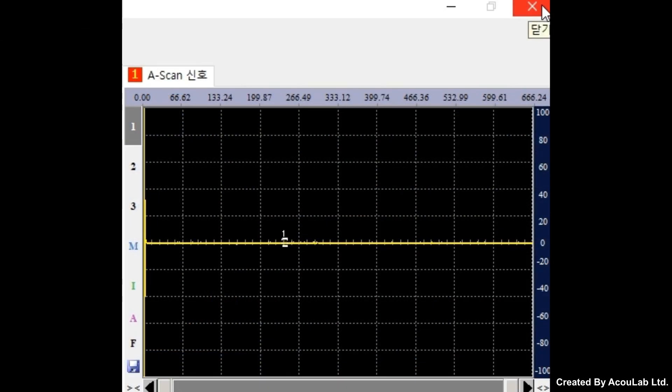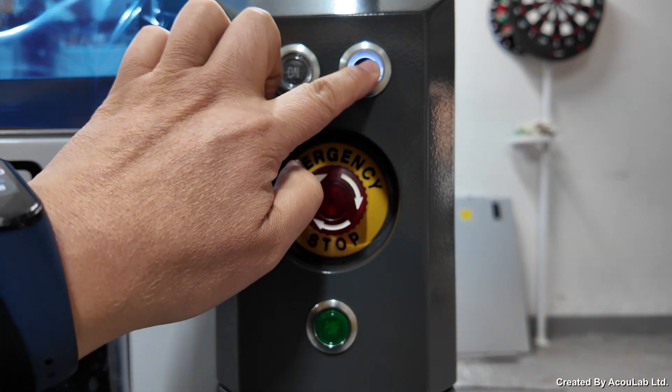Shut down the program. Press the off button for motor power off.